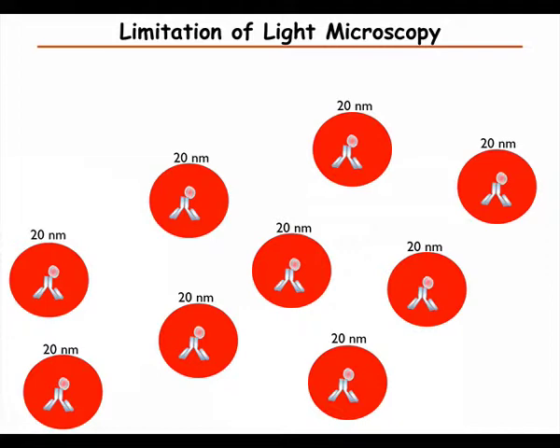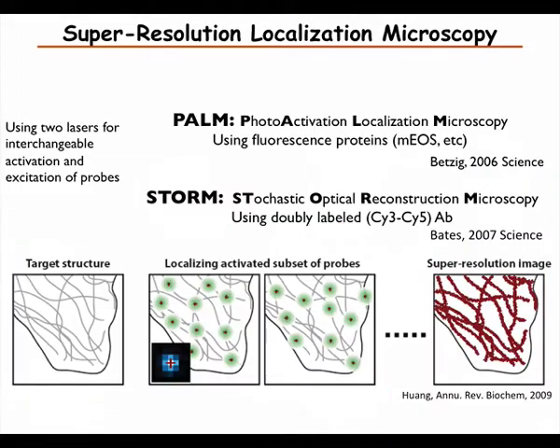So this is in collaboration with Eli Rothenberg in the biochemistry department, and he has worked out this method so he can get about 20 nanometer resolution this way. So there are several different versions of this.